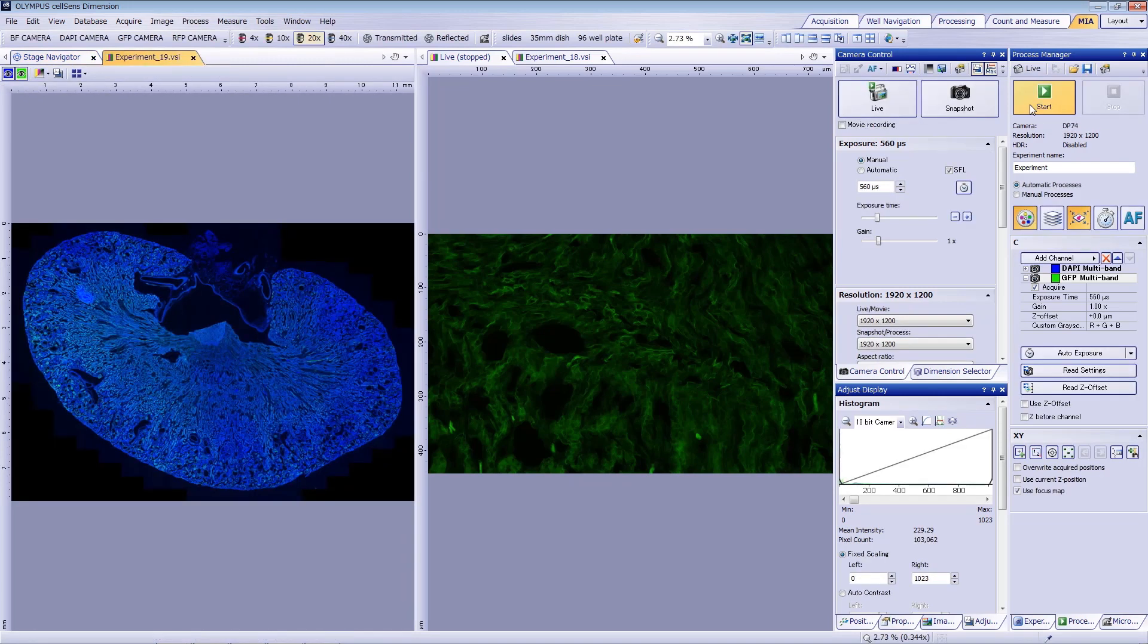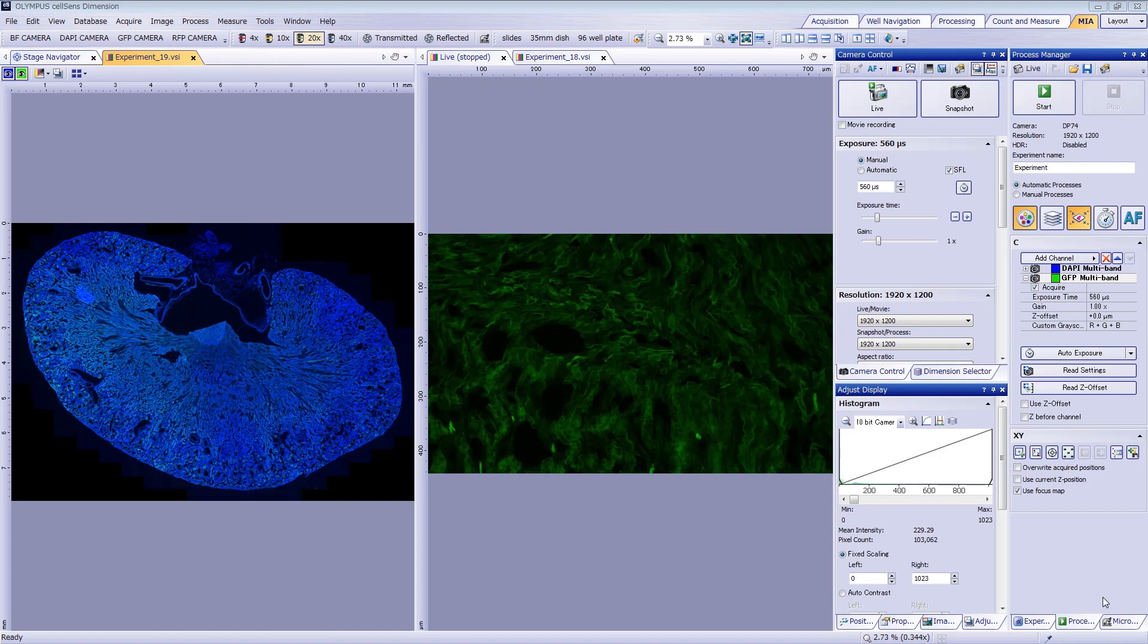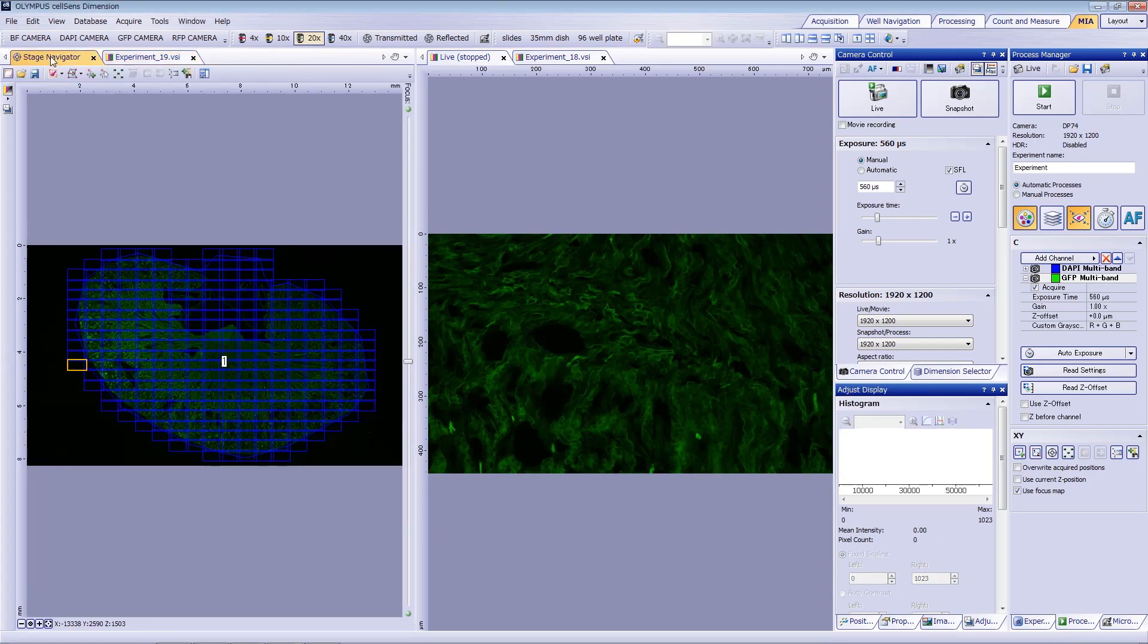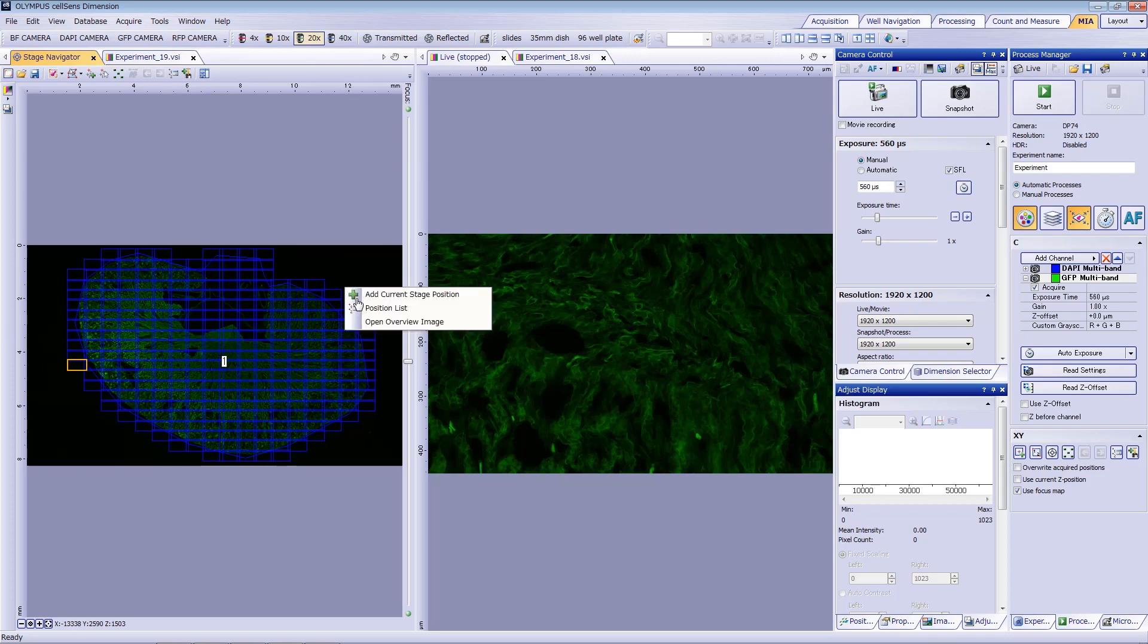When you've confirmed that the image was acquired as expected, you can close the live window. We recommend saving your overview image so that you can view it later with your high-resolution image. To view your overview image as a file, right-click on the image within Stage Navigator and click View Overview Image.